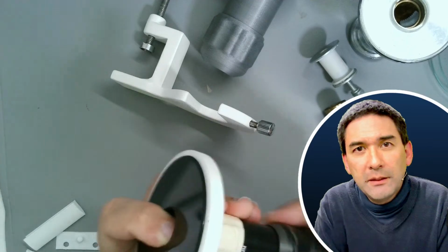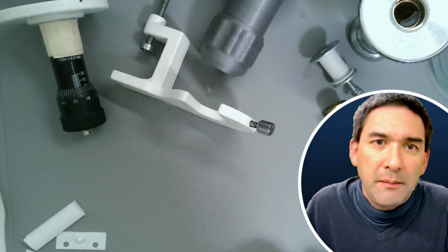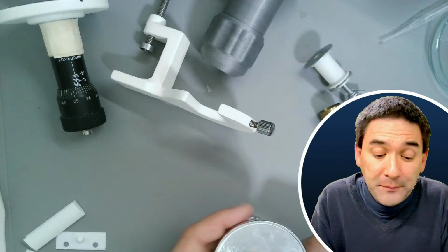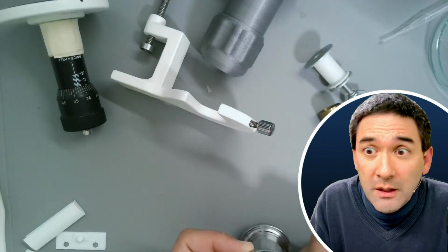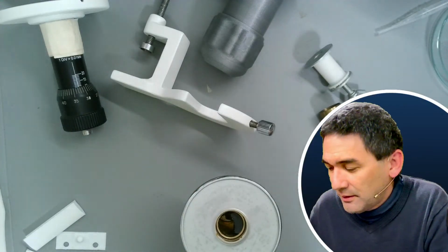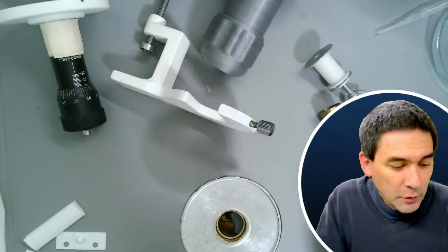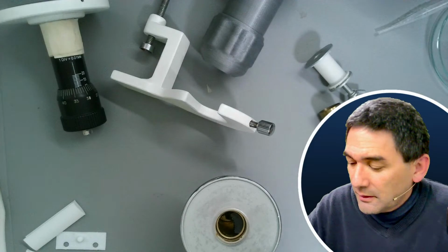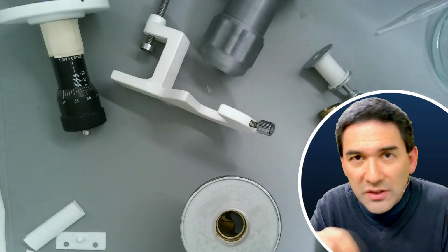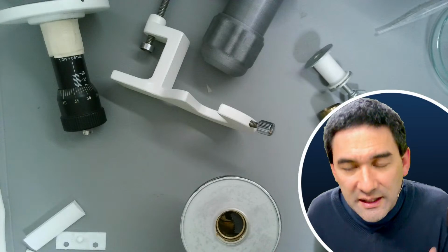I'm currently in the process, because one of my students needs it, of making a carmine acetate stain for, how do you call this, chromosomes. Carmine acetate is used for chromosomes, and I'm currently making a stain. I actually wanted to buy a ready-made stain from a company, and the company had high safety regulations and wanted the institute to sign a document, and it's complicated. So companies don't always want to send stains and chemicals.